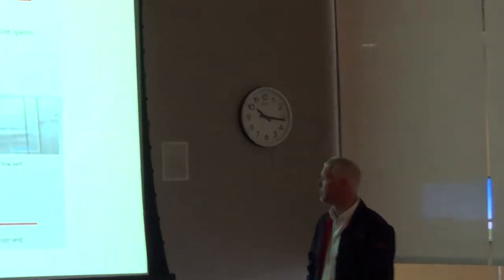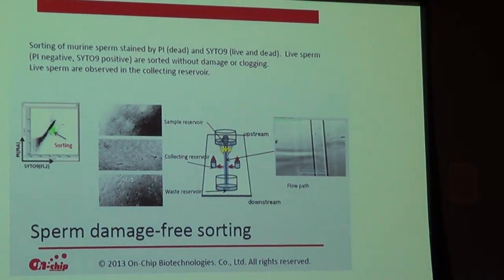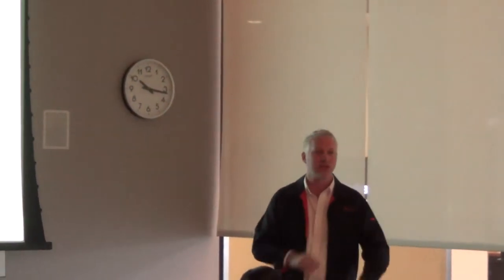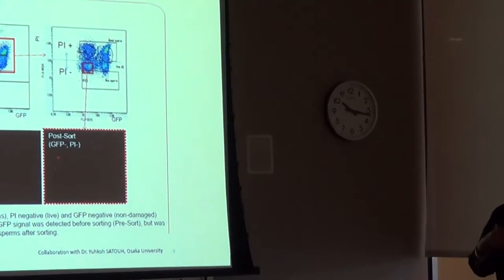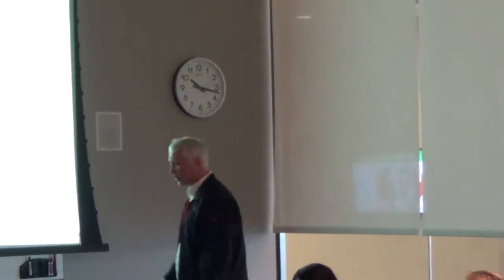They've done this in Japan, looking at sperm sorting, and they're very interested in maintaining the motility of the sperm. They want very active and bouncy sperm, and they want it to make it through the channel intact. In this experiment, you have a dual labeling strategy, looking at the head and the tail of the sperm, and demonstrating that both make it through intact by counting the result, and looking pretty good there.